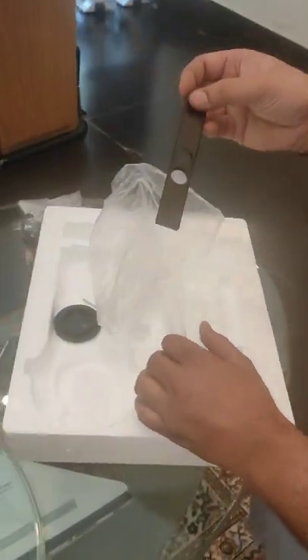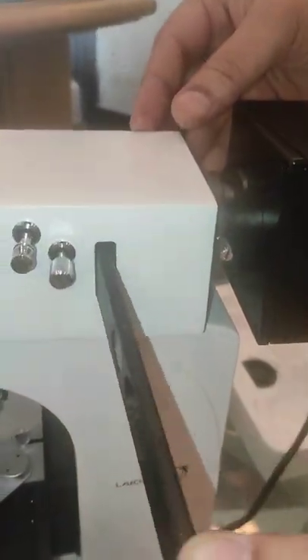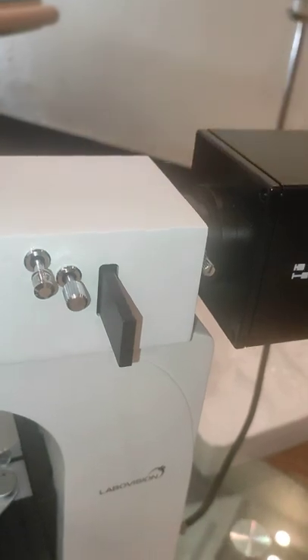Now we are going to place the filters. We are going to slide in the section of the head of the fluorescence attachment. So this is the slider filter.